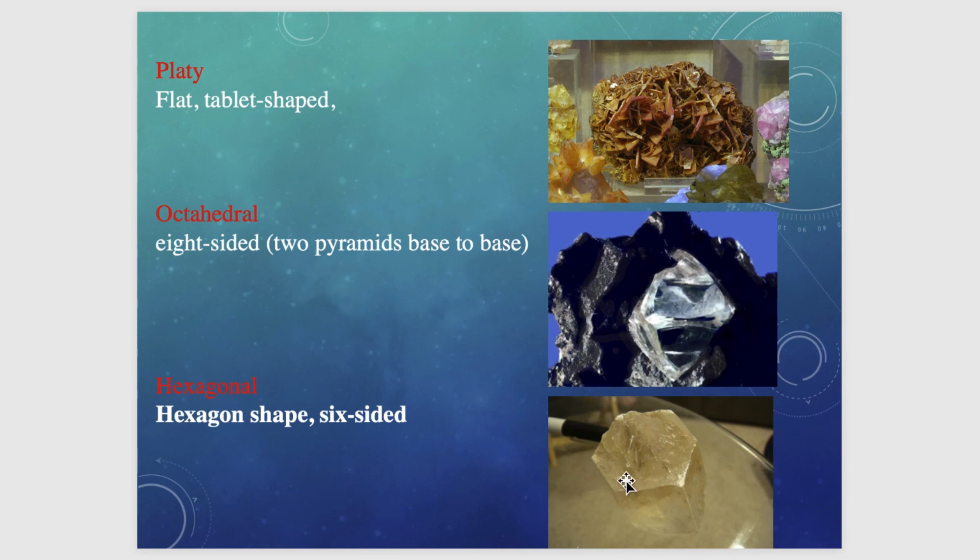Quite useful as well is the fact that you have these hexagonal sections. So if you have prismatic hexagonal sections, quite often you're dealing with quartz. So you can see here the bipyramid, at least part of the bipyramid, and also the hexagonal morphology is very helpful to differentiate this mineral from a carbonate. So quite often this will be quartz, and also some of the tabular minerals we saw, such as micas, can have this hexagonal shape, and some of the sections also on the amphibole will be hexagonal or pseudo-hexagonal as well, although the faces tend to have different dimensions in amphibole. But they can be useful for the recognition of amphibole.